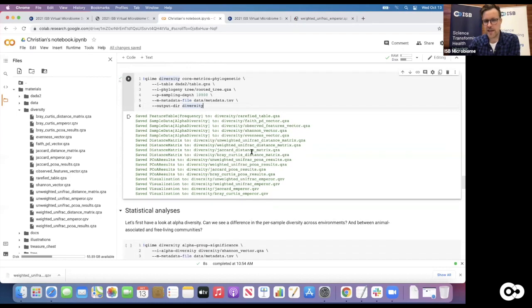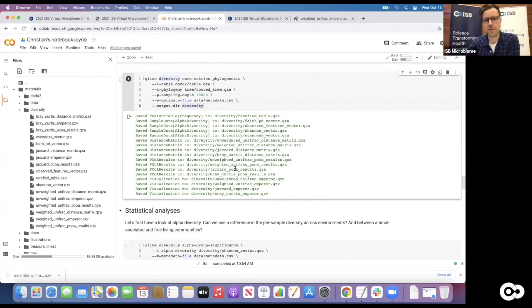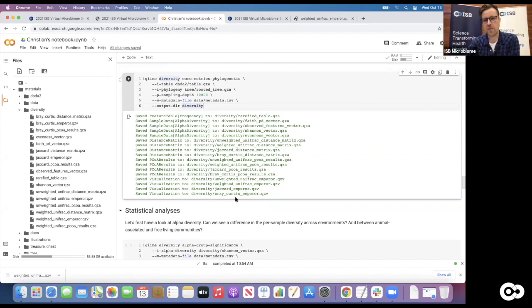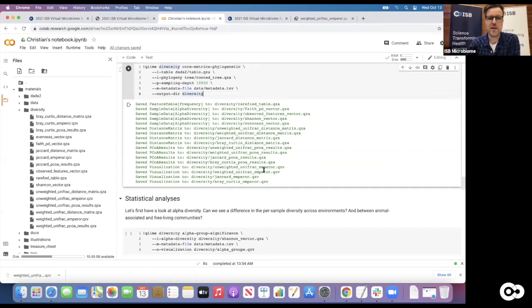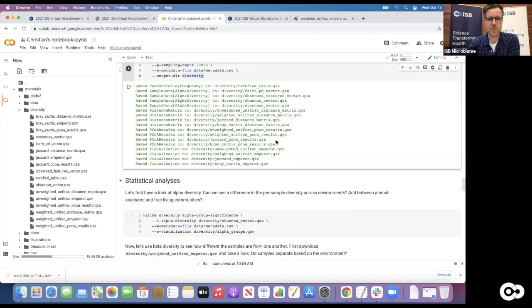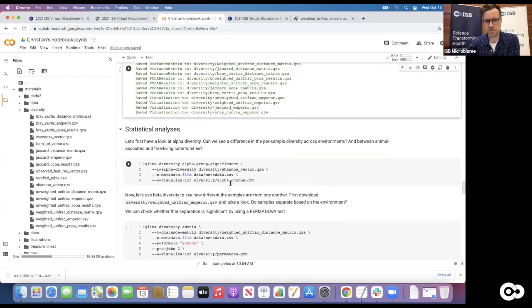So we generated all of that and have the distance matrices here - we have the weighted UniFrac distance matrix and a lot of others. Jaccard, for instance, is a distance matrix where you only look at whether organisms are present in a particular sample, without taking abundance into account. We also have Bray-Curtis, which doesn't take phylogenetic similarity of the sequences into account and doesn't use the trees we built - it just checks if there are similar organisms and similar abundances. We can use any of those, and let's start with alpha diversities.